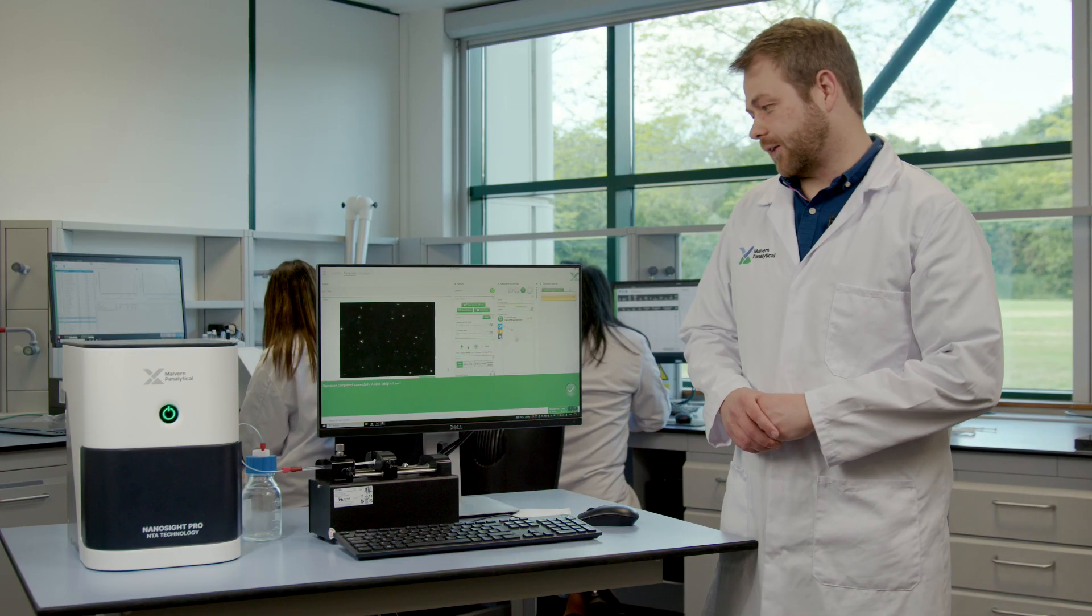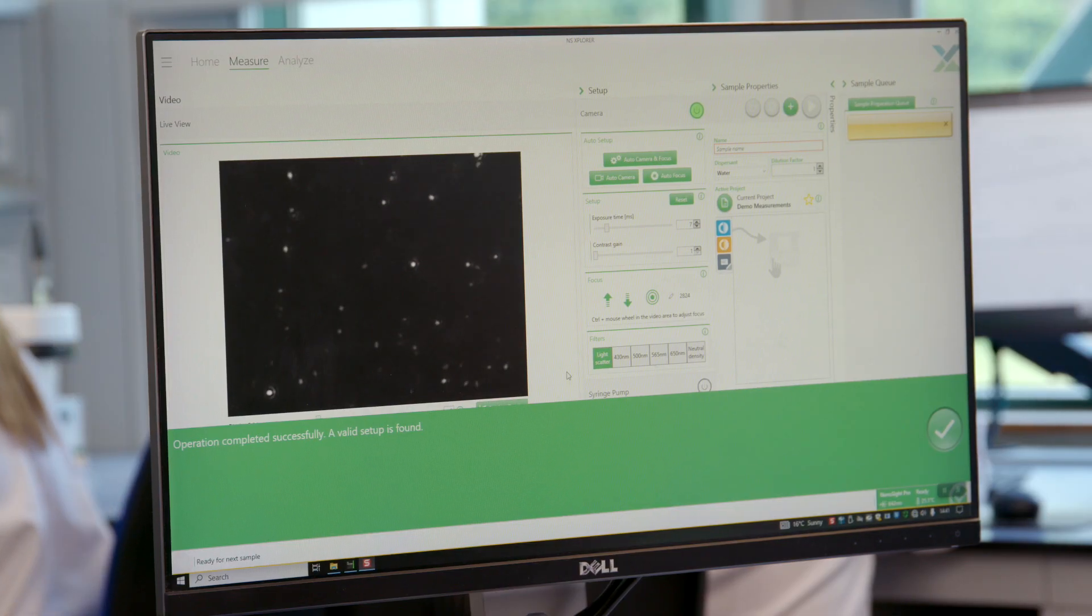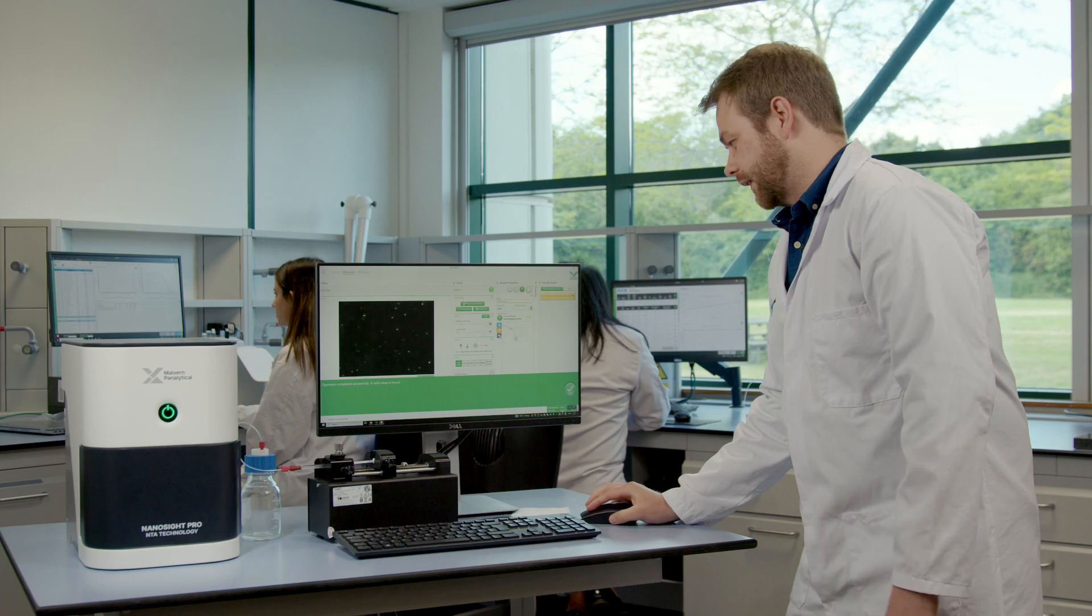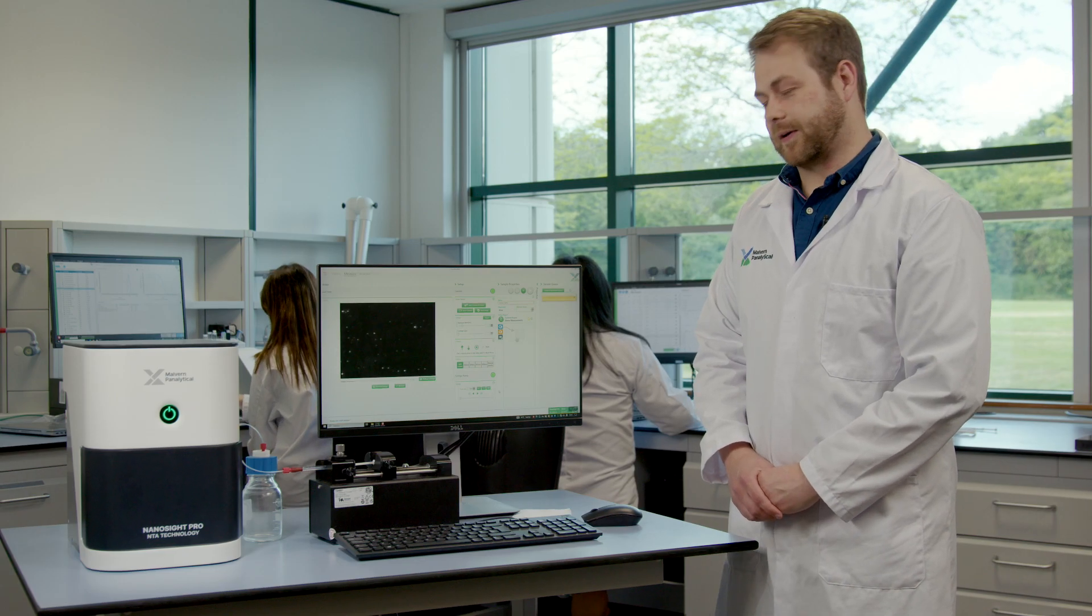The software has now found the optimum setting for the focus so now we can look at setting up the rest of the measurement. To find this easier, get the sample flowing. I'm going to start off the syringe pump at a high flow so we just turn it on here and then click the 200 and once that gets going we can then slow it down and make sure we get a slower steady flow to track the Brownian motion of the particles.